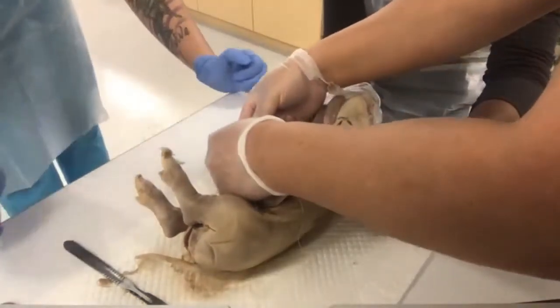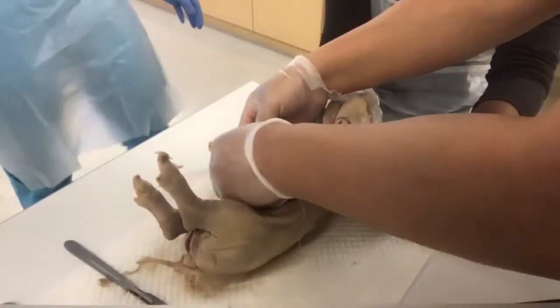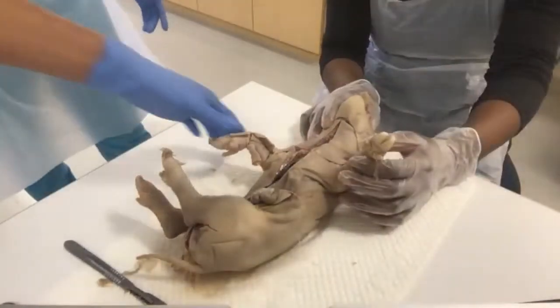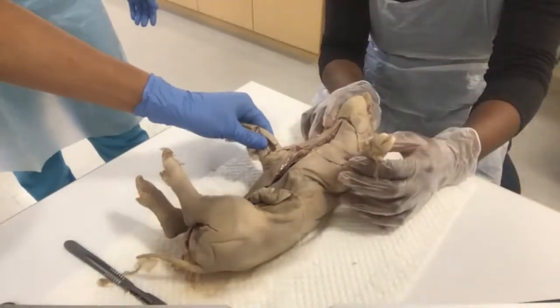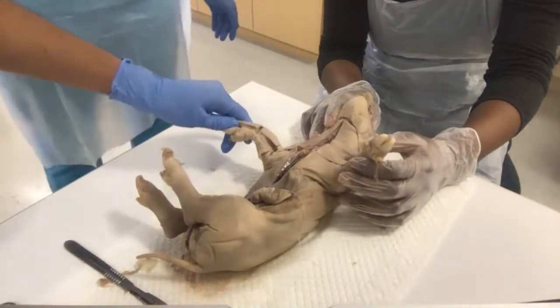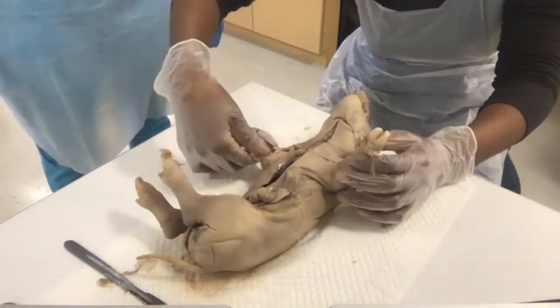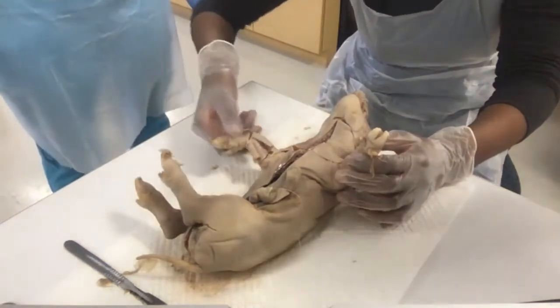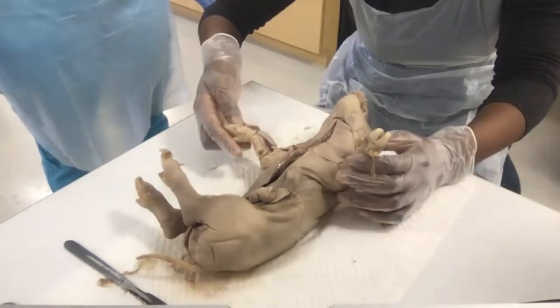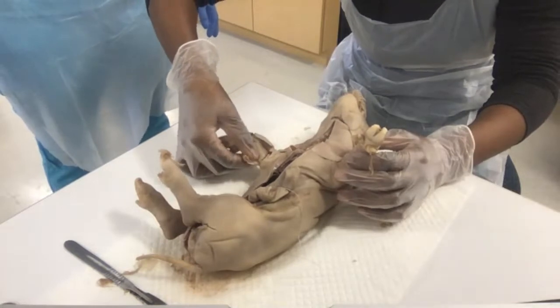Yeah, so we all know what bone feels like. It's much harder. And then feel the muscle. Feel the muscle, feel the bone, and feel the skin, everybody. Now, the skin is tough, but it's not as tough as the muscle. The muscle is tough, but it's not as tough as the bone. So that's also another thing that you're doing when you're doing surgery. You use your hands to feel things. And we know that from last week when we did the heart to identify arteries versus veins.